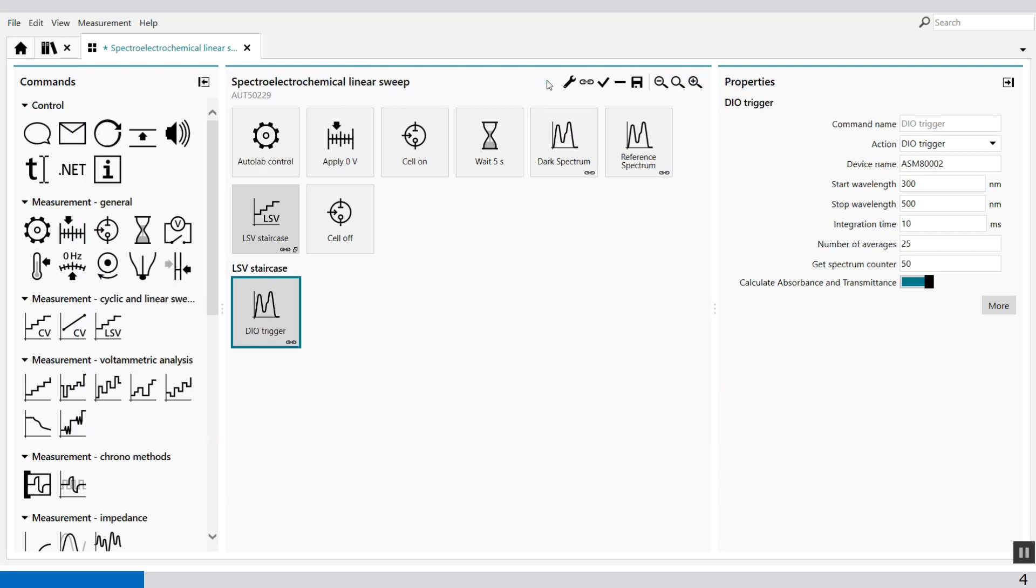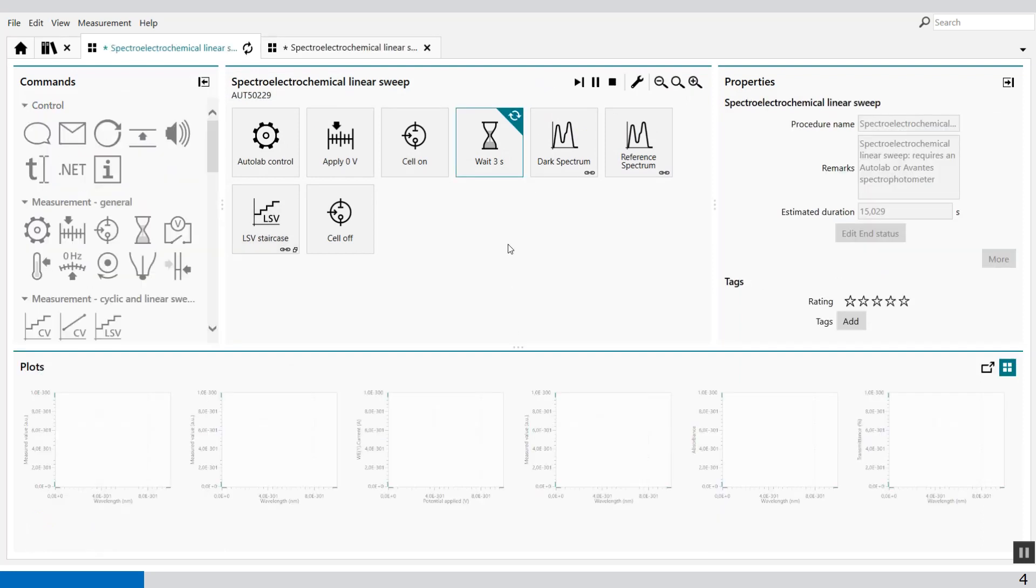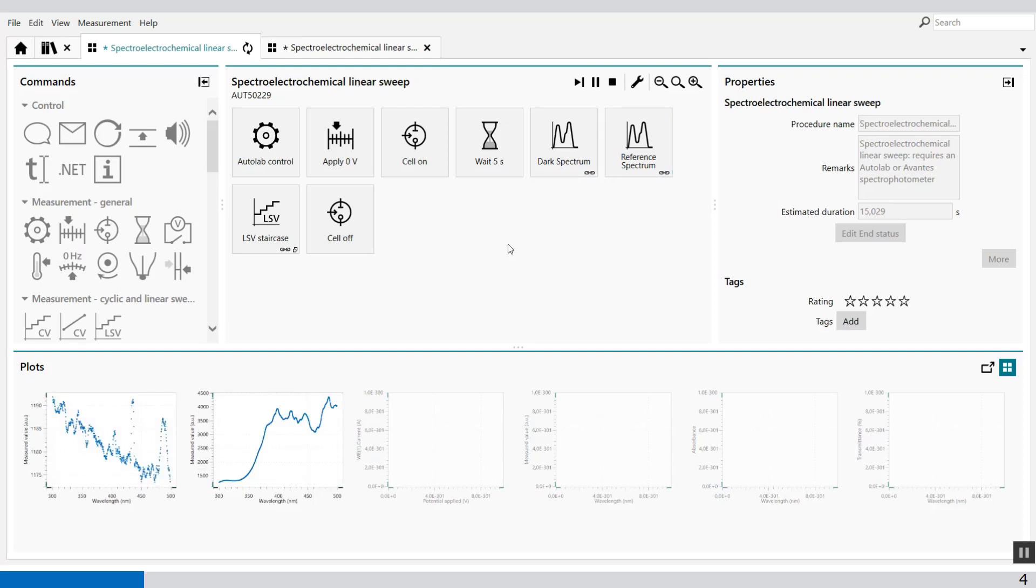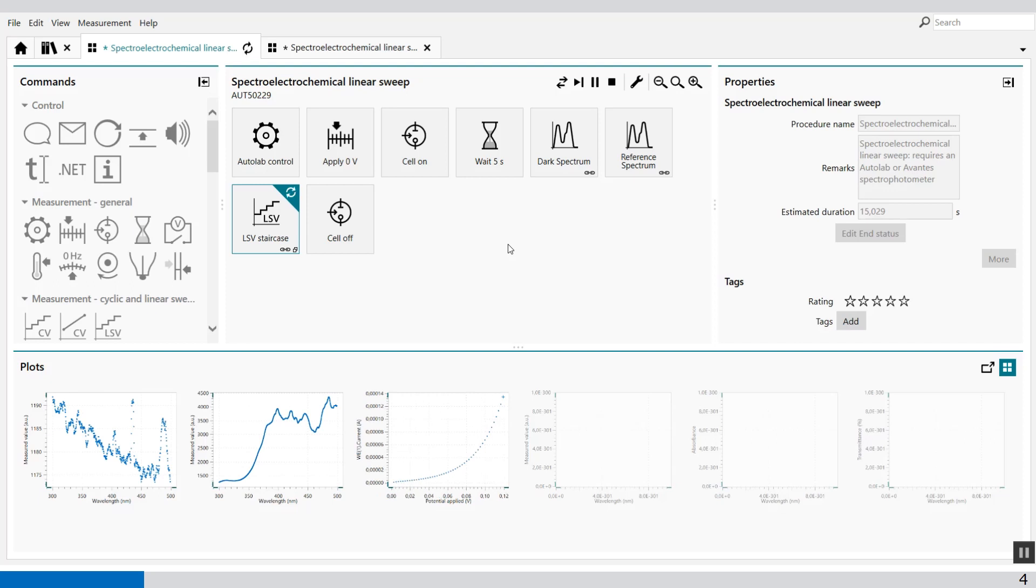Press start. And the measurement will run. First, we have the dark spectrum. This is dark. Then we have our reference spectrum. This is my linear sweep voltammetry.